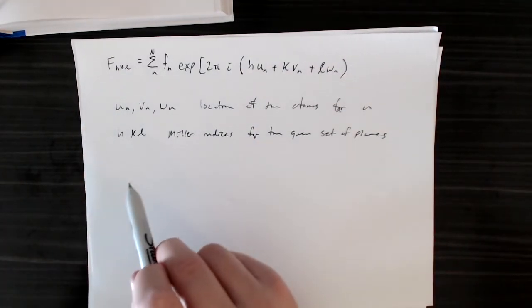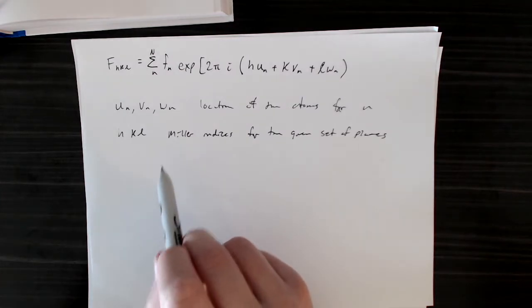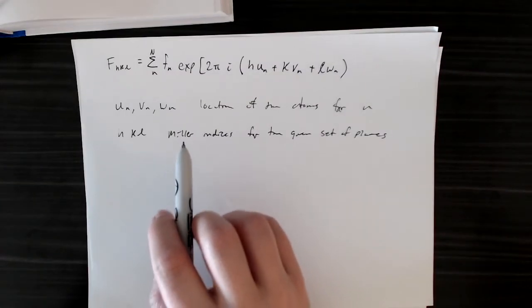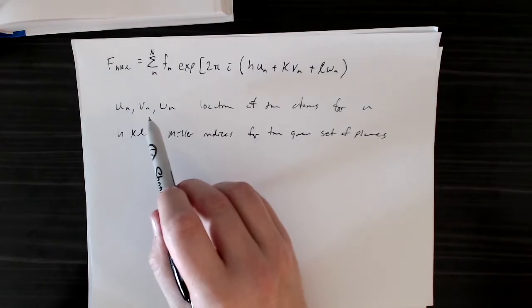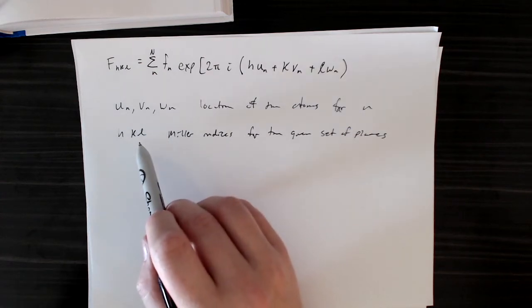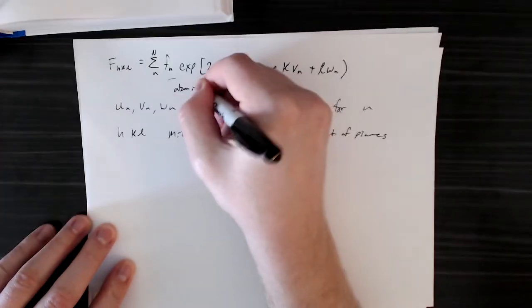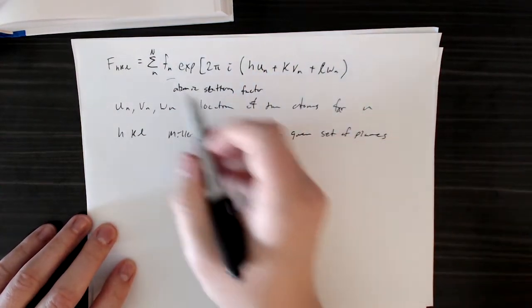So we can calculate this for a given structure, and a lot of times these have been calculated for us. So feel free to look up references if you get stuck in the structure factor calculations for your given structure. We should know where the positions are from looking at the unit cell, and we should know what the planes of interest are. And so the last part is going to be this atomic scattering factor. And so these are tabulated.